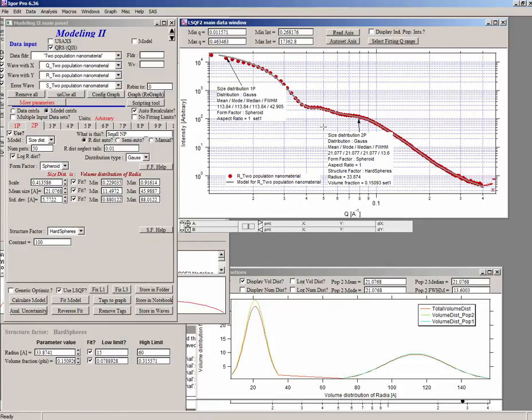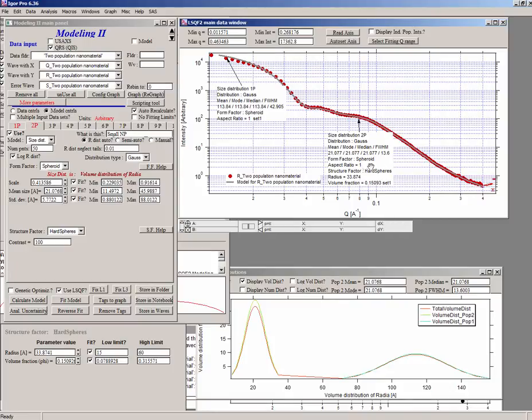So with that, with some uncertainties about making choices like is it a Gaussian distribution and a few other things, we have generated a small angle scattering which well satisfies or well describes these measured curves. And assuming we're not too far from some of these assumptions, we actually have a solution for our small angle scattering data.